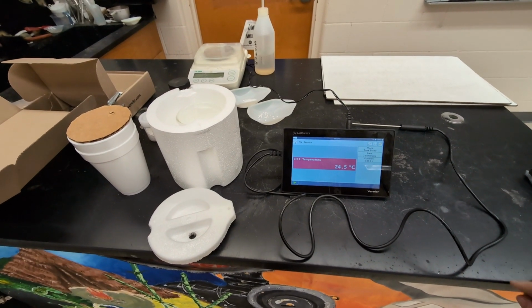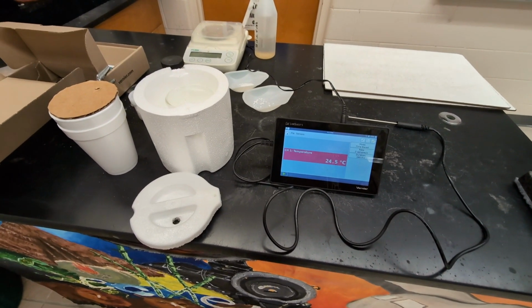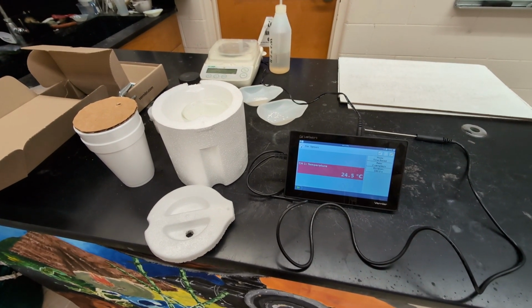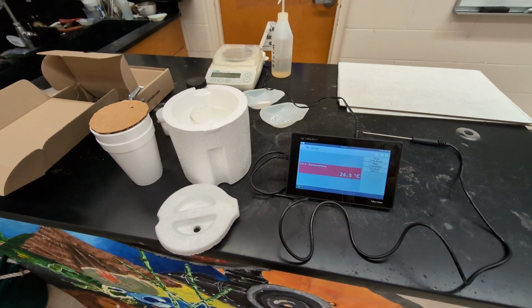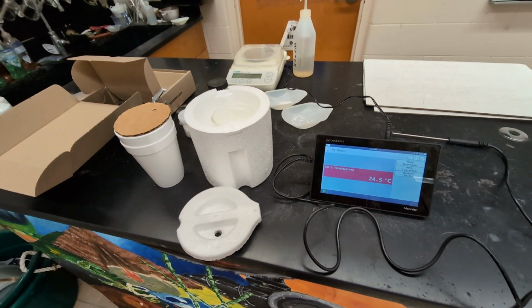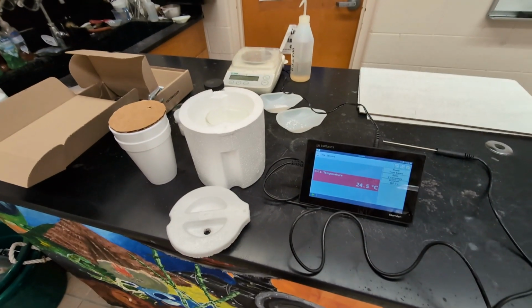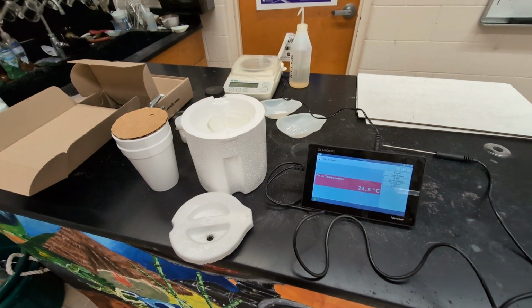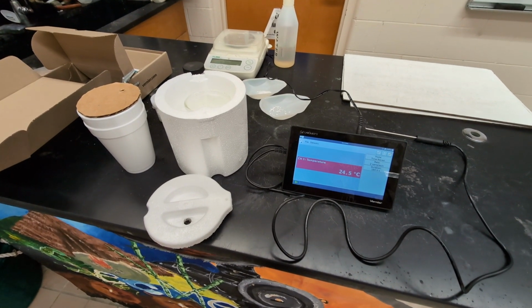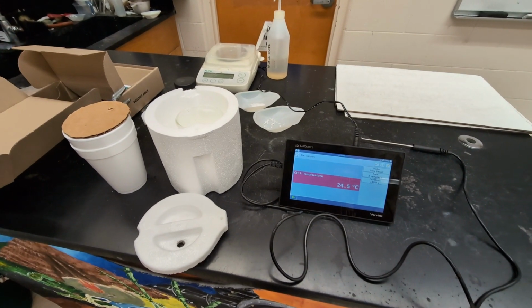of them that involves just a little bit more of the inquiry process, where students have to look at a number of different criteria to evaluate the effectiveness of different substances for their use in hand warmers. Obviously it needs to release heat. It really needs to release an appropriate amount of heat so you don't have safety issues. The substances should be environmentally friendly if they are disposed of improperly, and you have to consider cost as well. Now, you could do all or only some of those parts to have an effective version of this lab.